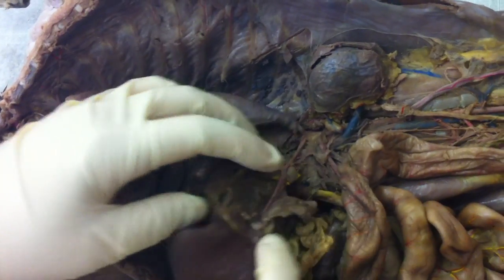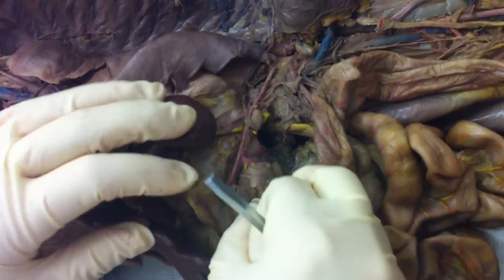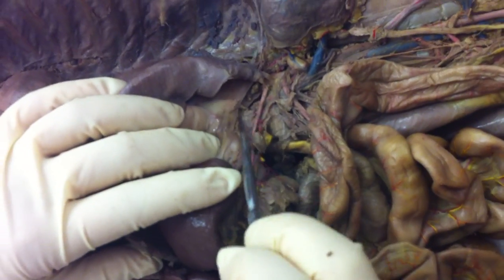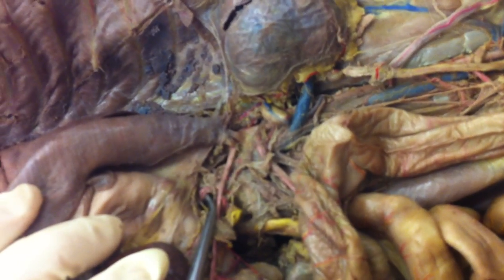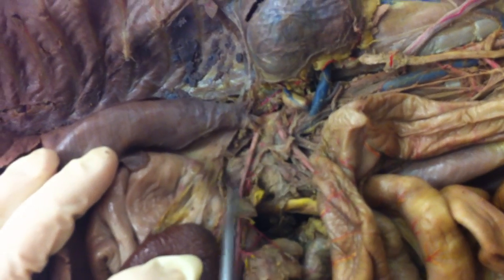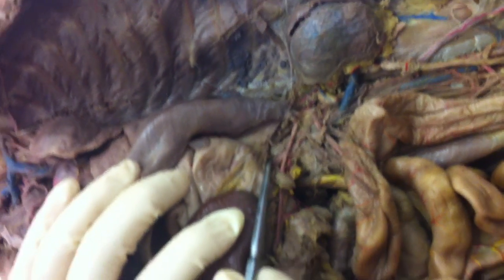Just like a tree trunk, it's going to have branches coming off of it. And it should have three that you should be able to identify. The first one is kind of buried in there. You won't be able to see where it's going to, but based on its location from the celiac trunk, you should be able to ID that this first one is going to be the hepatic artery.